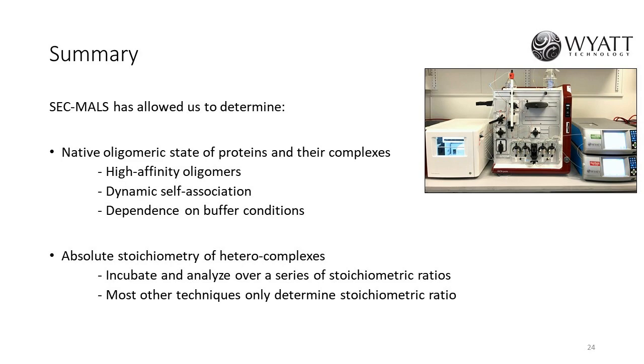As I said before, the NAP proteins cannot exist as monomers. They are constitutive dimers. The tailing is most likely due to either a heterogeneous mix of oligomerization or degradation. It's more likely the protein is degrading, and that is probably why there is a small tailing that's formed. The molecular weights that we selected for the study are for a defined peak region, so we try to avoid including the tail.